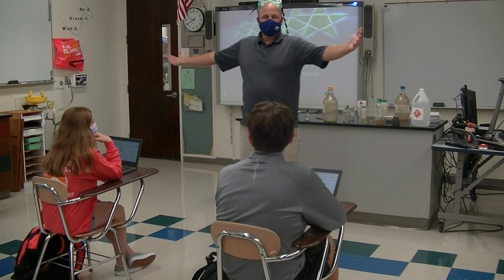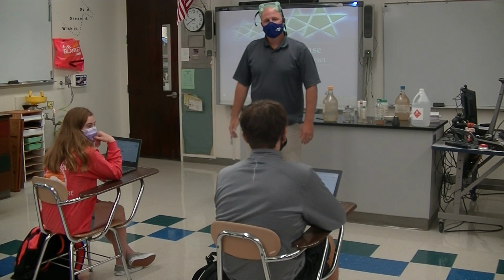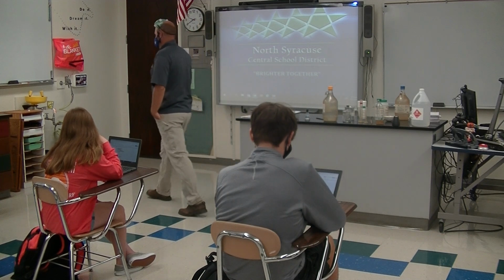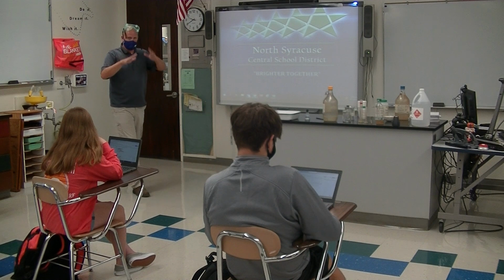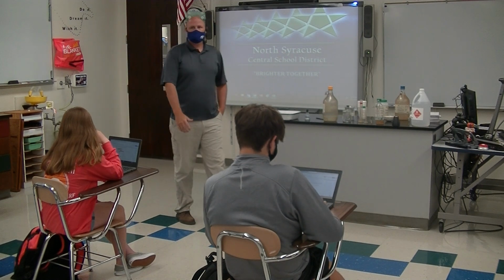Once again, look around the room. Yeah. Wash it in the yellow sink. The yellow sink or the eye wash station. So you come over here and you turn it on. So it's got water that kind of comes out. Now what do you do with your eyes?